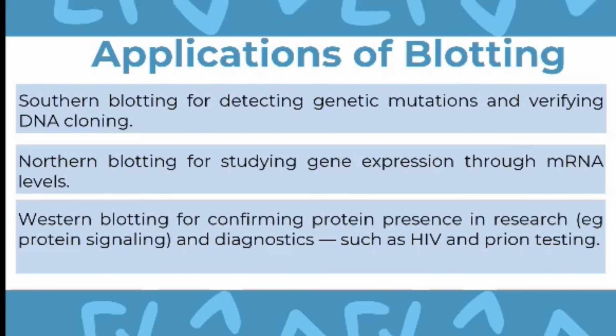So these are the applications of the different blotting techniques. Southern blotting can be used for detecting genetic mutations and verifying DNA cloning. Northern blotting for studying gene expression through mRNA levels. Western blotting for confirming protein presence in research and diagnostics, such as HIV or prion testing.